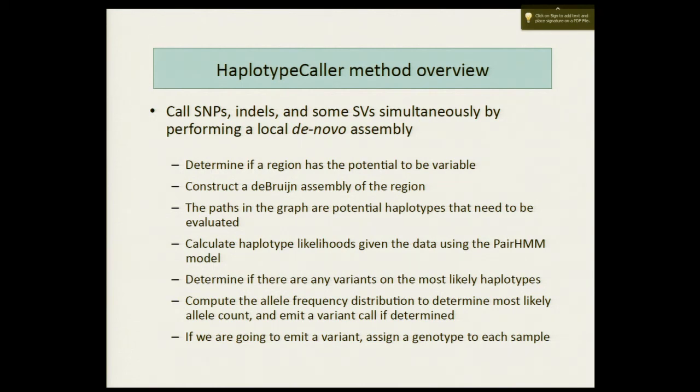Yes. What's the speed difference between the Haplotype Caller and the Unified Genotyper? So the difference in terms of speed, it used to be 10 to 1. I don't know. It's probably like 5 to 1 now. It's 5 times slower. And there's tons of parameters that you can play with to trade off between runtime and sensitivity. I'll talk about that a little bit. The problem is you're doing a lot more work, so it's slower. It's also harder to parallelize, which makes it, depending on how your pipeline's set up, even slower than 5 times slower. Sorry, so the haplotype caller is slower? Yes.